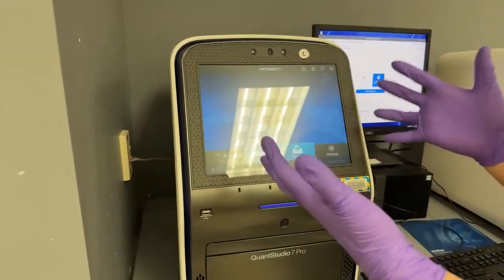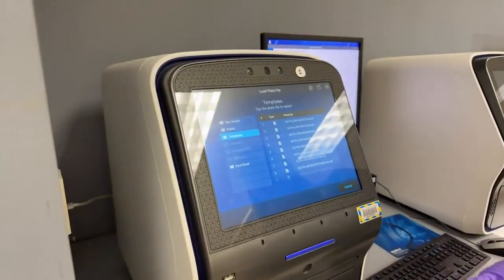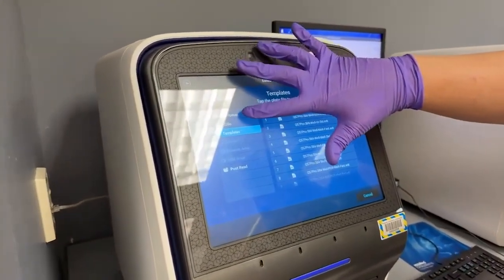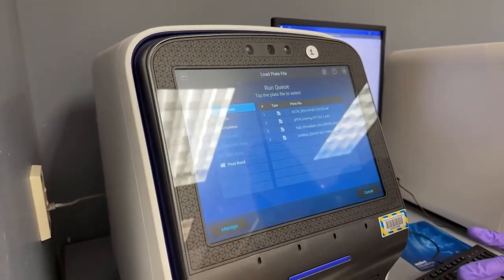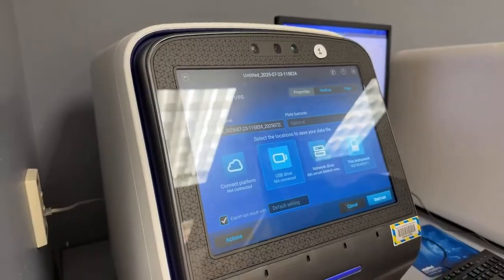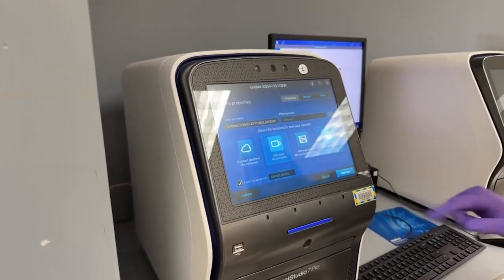All right, there's a great big button in the middle of this screen, and that's what we're going to use. We click Setup Run. Now, remember on the local computer, I sent it to the Run queue. So now I select Run queue, and here is that template, which I had untitled. You can always check those names, and they do match.